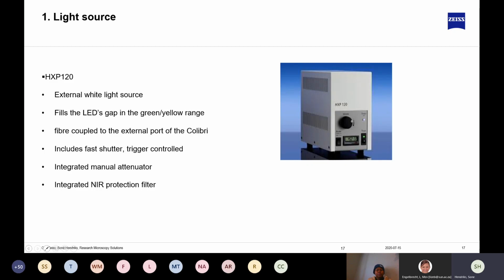The lifespan of a xenon-based lamp is anywhere between 600 and 2,000 hours. So they're also a lot more stable than HBOs. Typically, if a customer doesn't know what type of dyes they're going to use, or they're only starting out with fluorescence, this is what we would recommend you start off with, because there are no limitations. You can simply add different filter cubes as your research develops.